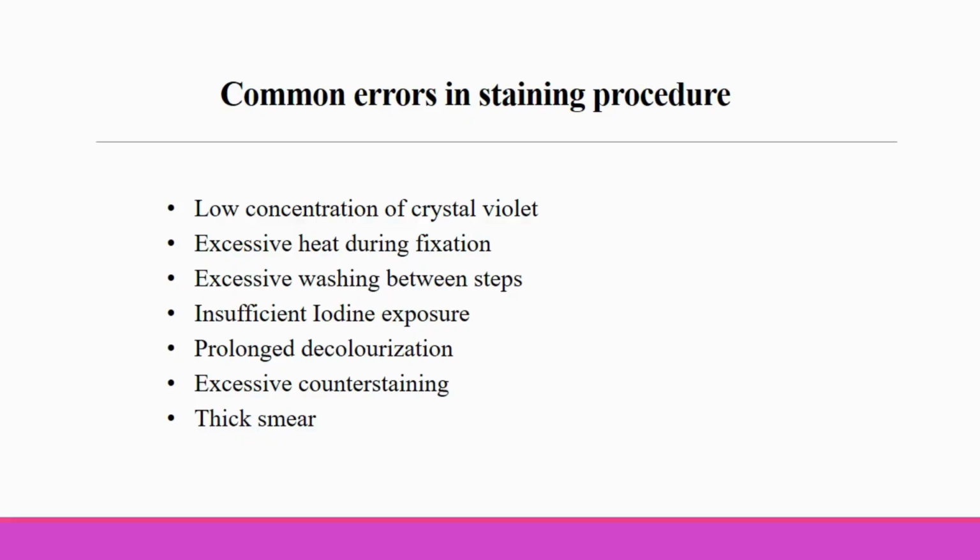The fourth is insufficient iodine exposure. The fifth is prolonged decolorization. And the sixth is excessive counter staining. And the seventh is preparation of the thick smear, which can lead to non-uniform staining. And so there can be a mixed growth seen.